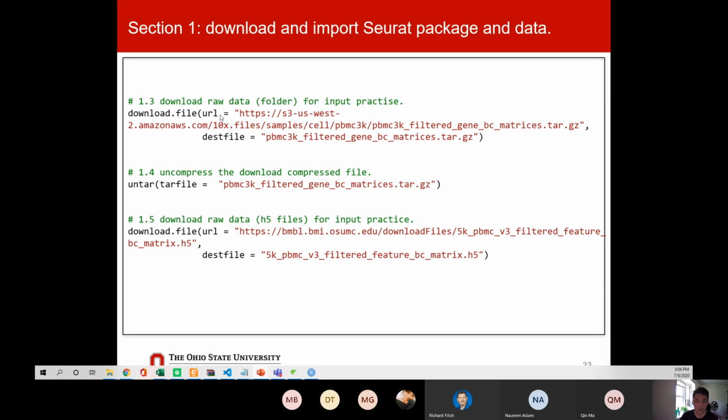The first file we will download is called pbmc3k filtered gene bc matrices, which is derived from 10x Genomics. These two files, 1.3 and 1.5, were both generated by 10x, but with different data formats. The first format is a folder.